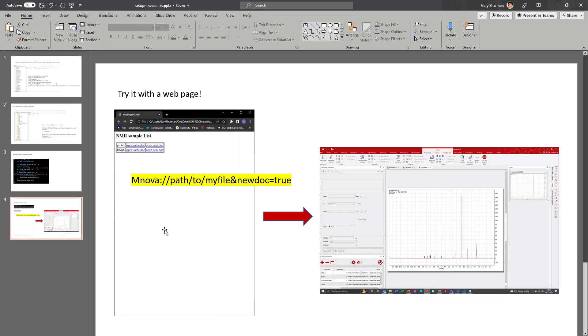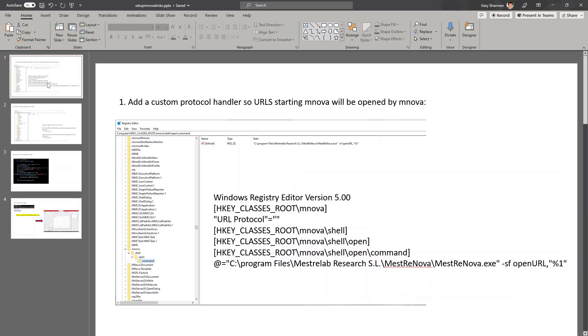But how does the operating system know that a URL starting like this should be opened with Mnova? Well, you need to tell it.